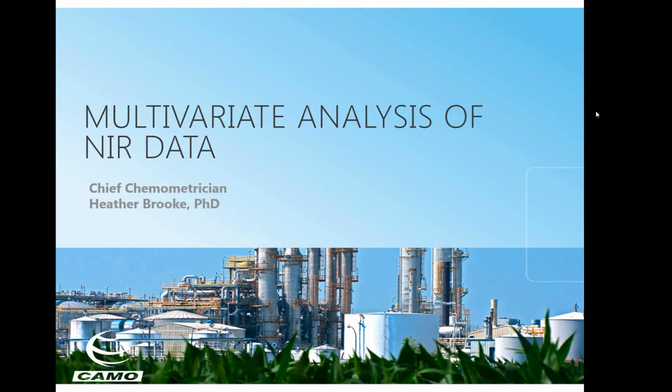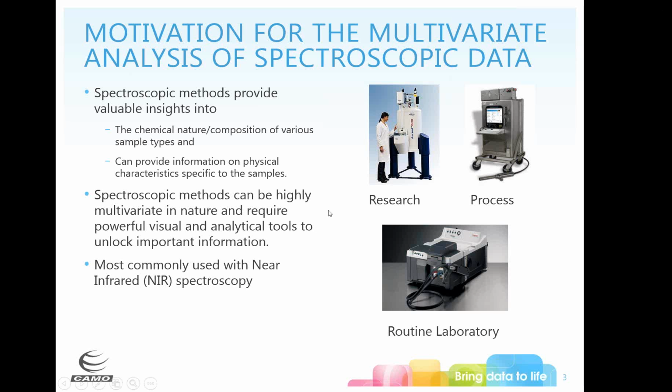Great. So today we are going to talk about multivariate data analysis for NIR data. So why do we do multivariate analysis on NIR?